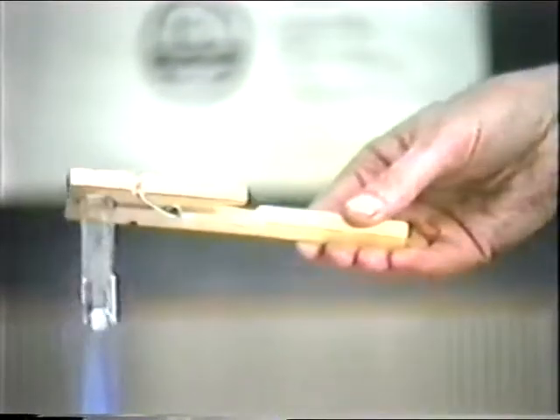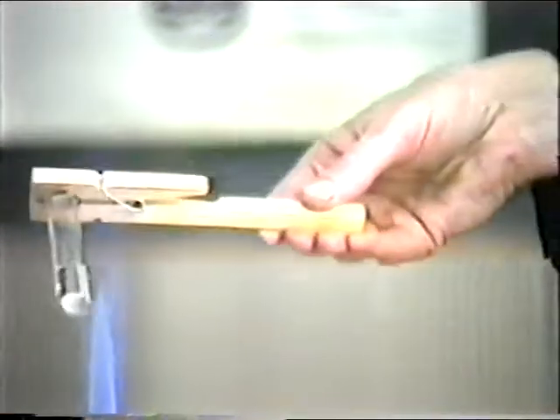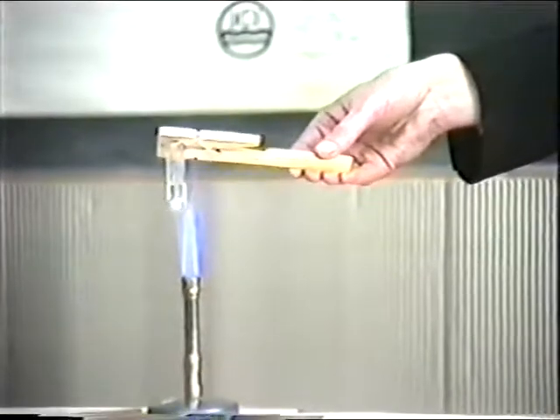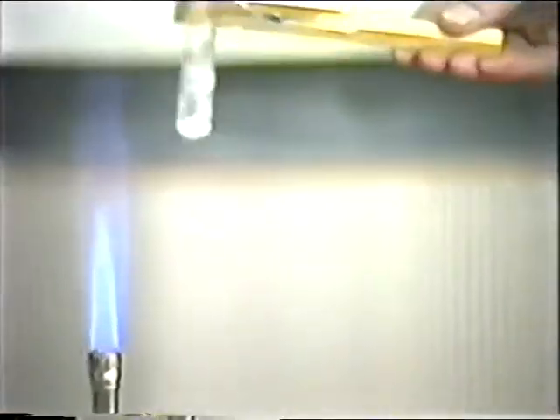Now, you might be surprised to see that I'm heating a substance which is highly inflammable in a test tube, and indeed this is an extremely dangerous thing to do. However, the main thing here is to prevent the mouth of the tube from coming anywhere near the flame. Provided that we keep the mouth of the tube well away from the flame, there is no danger whatsoever that the liquid will catch fire.